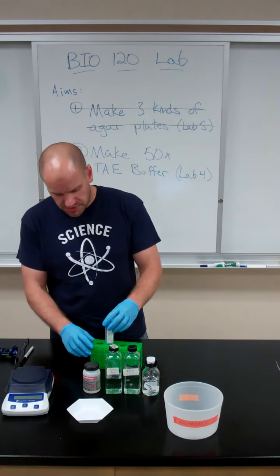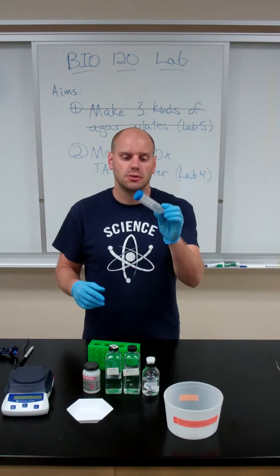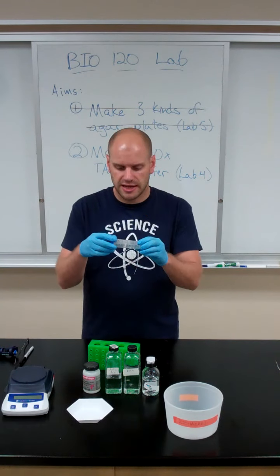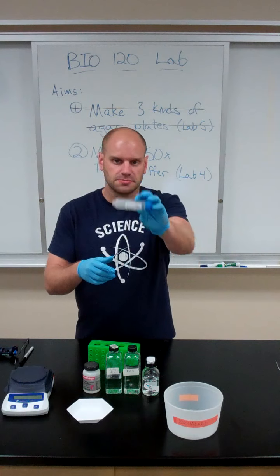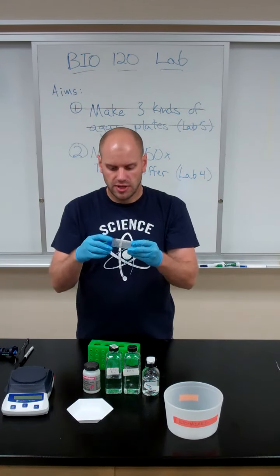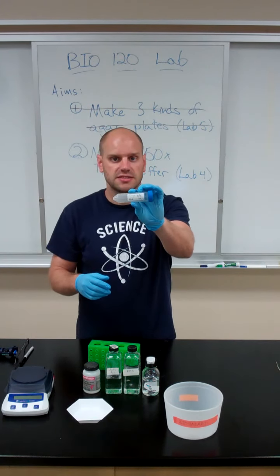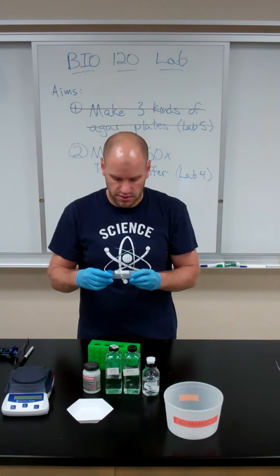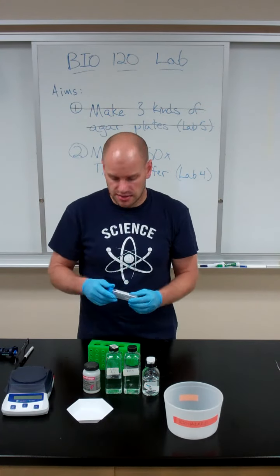We're going to make this in a 50 mL conical tube — the kind that usually has a blue top or an orange top and is screw-capped. It has a little white panel where you can label the tube. I've labeled mine '50X TAE' with my initials and the date. Remember, all three of those bits of information need to be on everything we make in this lab.